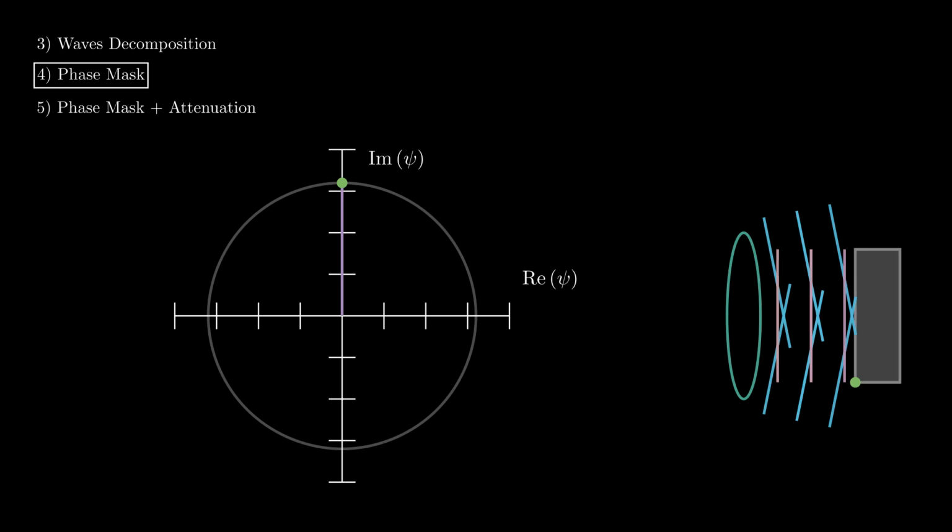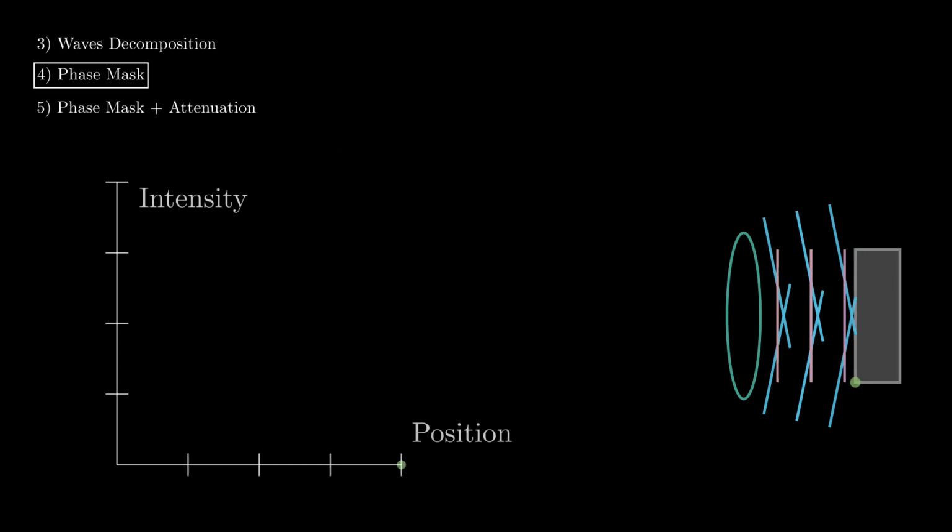Now the unperturbed and perturbed components are parallel to first order. Now, when scanning the field across the camera's plane, we see that the two components interfere constructively, and so the absolute value of the amplitude is no longer constant. When the camera measures the intensity, it will measure a photo which is no longer constant, and so we are finally able to see the phase object.